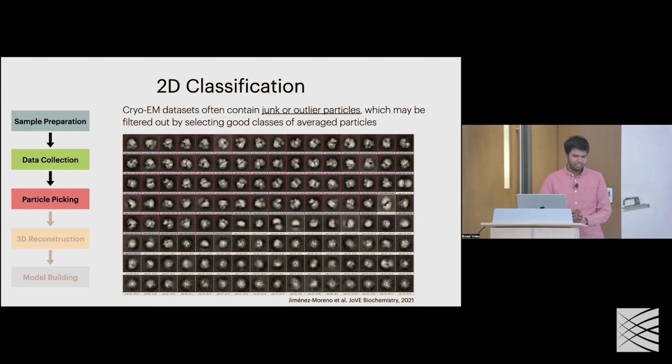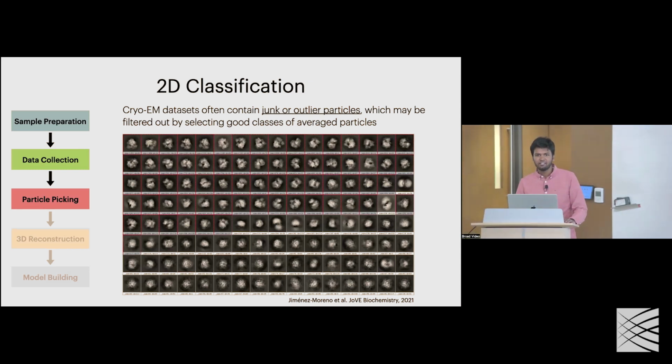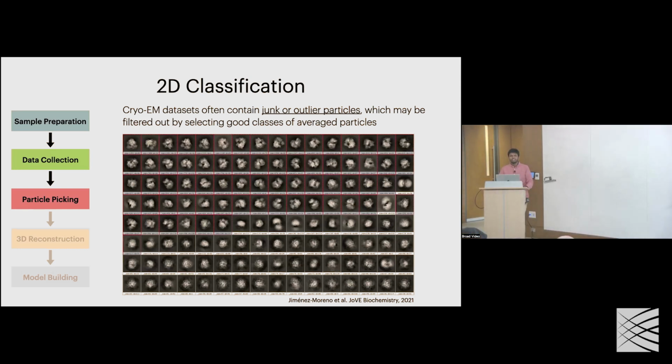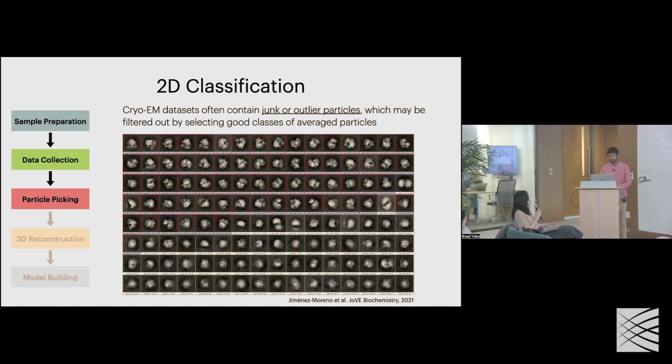Yeah, I don't know the exact year, but direct electron detectors, where you can get direct counts of electrons spatially, gave much better signal in these images. I don't know if you have additional context. Just echoing that, better hardware increased the amount of signal in the collected images such that now you can get atomic resolution structures. And this was about 2013.